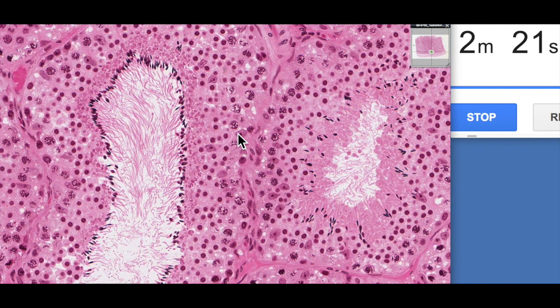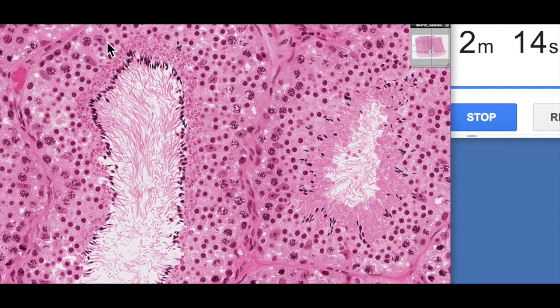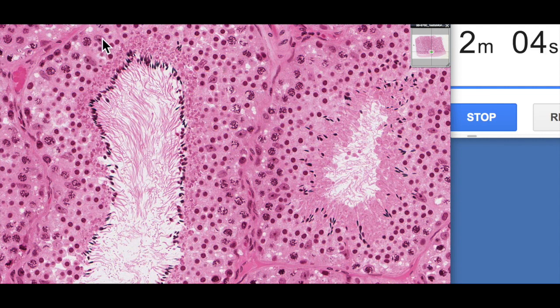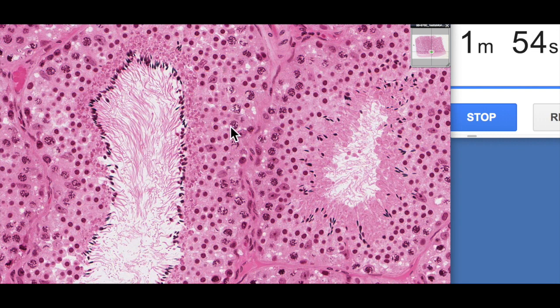If we have a look here, you can see these pale nuclei with the prominent nucleolus, found throughout the testis. These are the nurse cells, or sustentacular cells, or Sertoli cells. They have receptors for follicle-stimulating hormone, and they stimulate spermatogenesis, produce testicular fluid and androgen-binding protein, inhibin and activin, depending upon how well spermatogenesis is taking place.